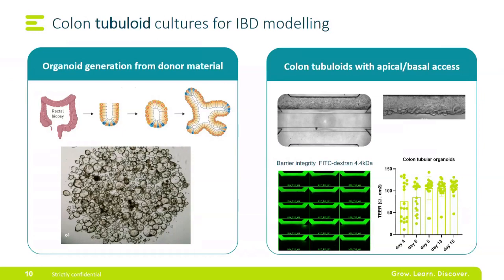You can also go to organoids, right? So we work a lot with the adult stem cell organoids that are developed by the group of Professor Hans Clevers at Utrecht in the Netherlands. So basically, you stimulate the LGR5 positive intestinal stem cells. You stimulate the Wnt pathway so that they are going to proliferate, and you can let them differentiate and develop all the subtypes of the intestinal model, and they typically look like this. So they're like little balls with a lumen, and there's fantastic assays that have been developed.